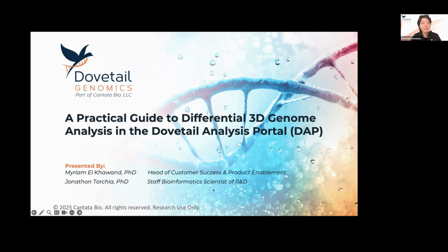Hello, everyone. My name is Ollie, the Technical Program Manager at Dovetail Genomics, and welcome to our Ask the Experts webinar, a practical guide to differential 3D genome analysis in the Dovetail Analysis Portal, aka DAP. Today's session focuses on how to move beyond individual 3D genome maps and begin extracting meaningful biological insights through comparative analysis across different conditions. We're joined by two experts from Dovetail Genomics.